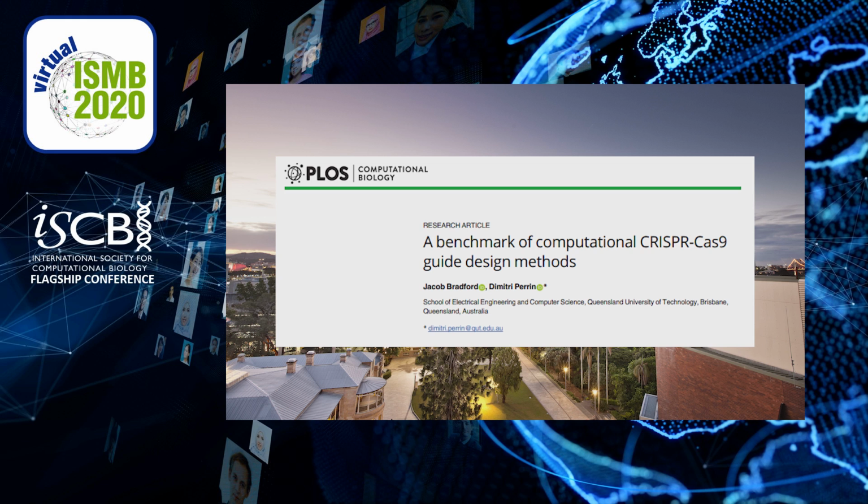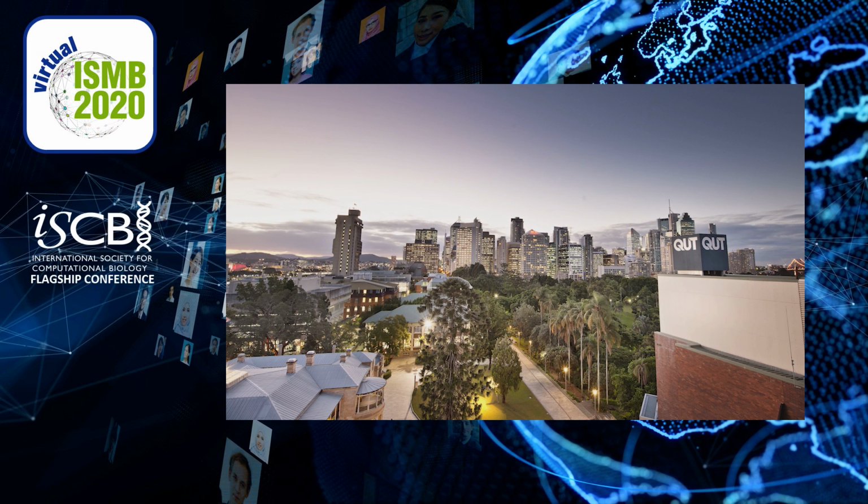Our goal was to produce Crackling to be more precise and fast in order to analyze large-sized genomes in a reasonable time. When evaluating guide specificity, it's important to consider other sites that differ by up to 4 mismatches when compared to the guide sequence, as Cas9 may cleave at these positions. This becomes a computationally expensive task. In previous work, we found that this often causes speed bottlenecks. To overcome this, we utilize an approach named Inverted Signature Slice Lists, or ISSL.